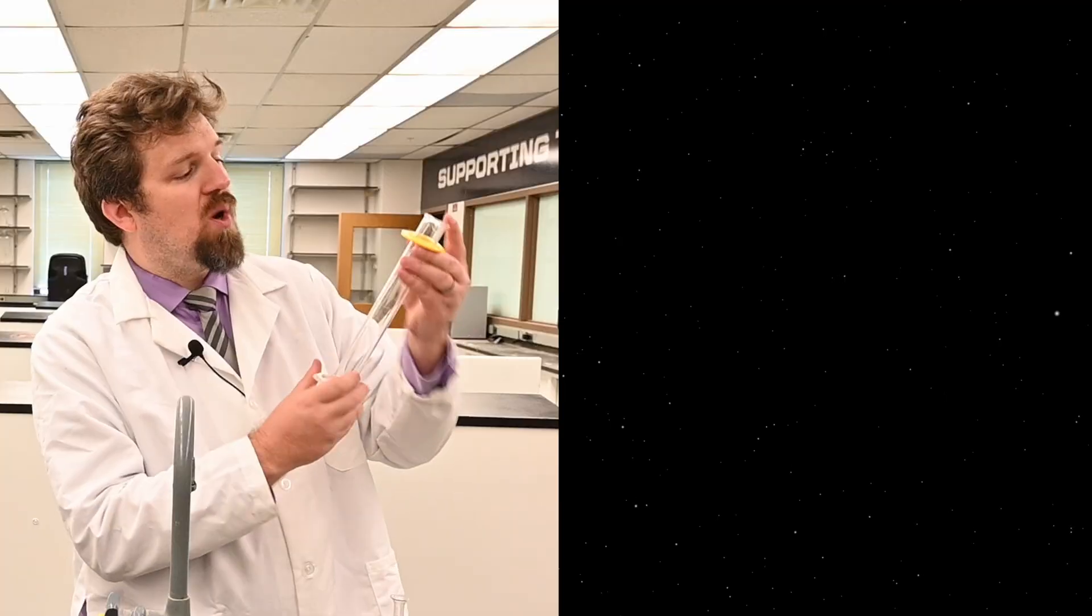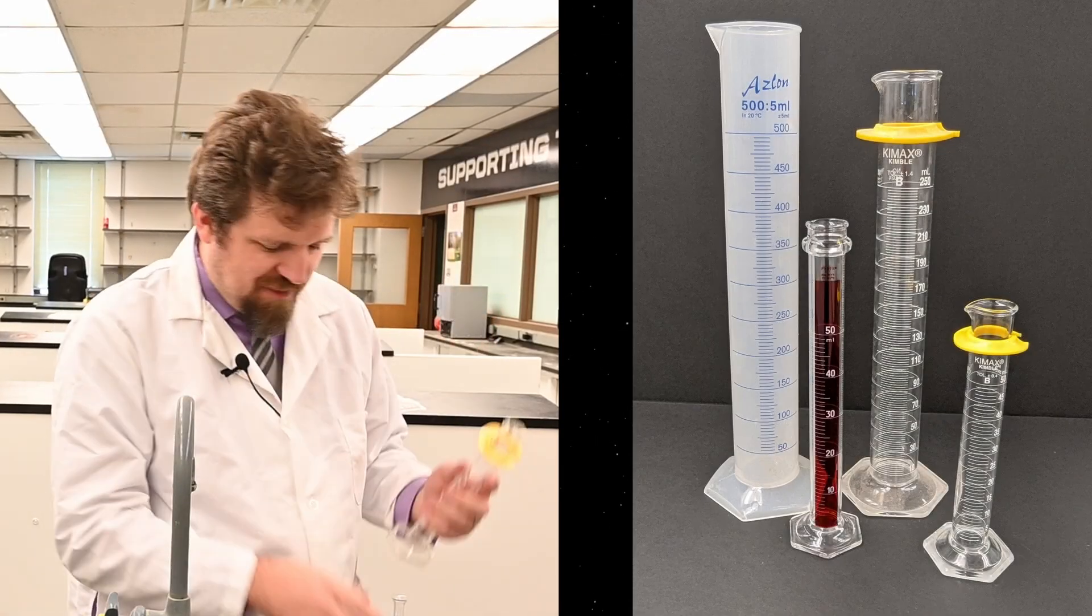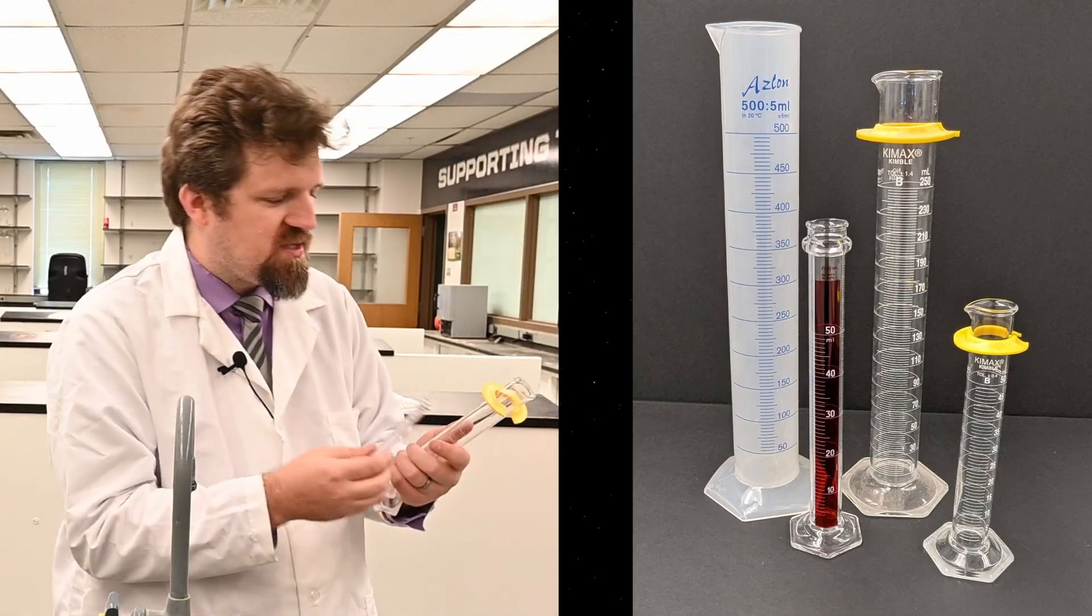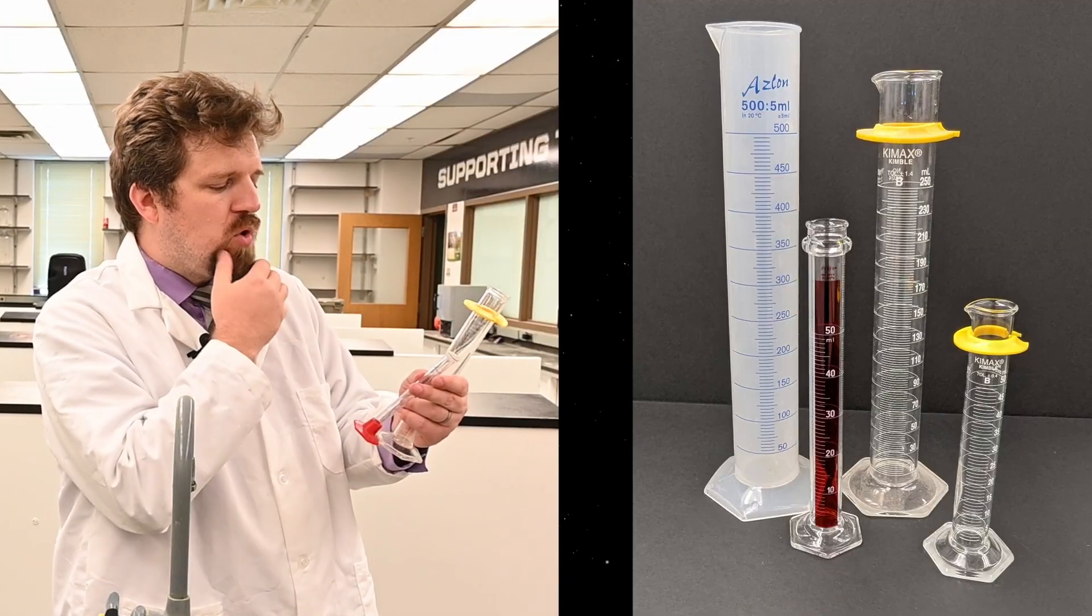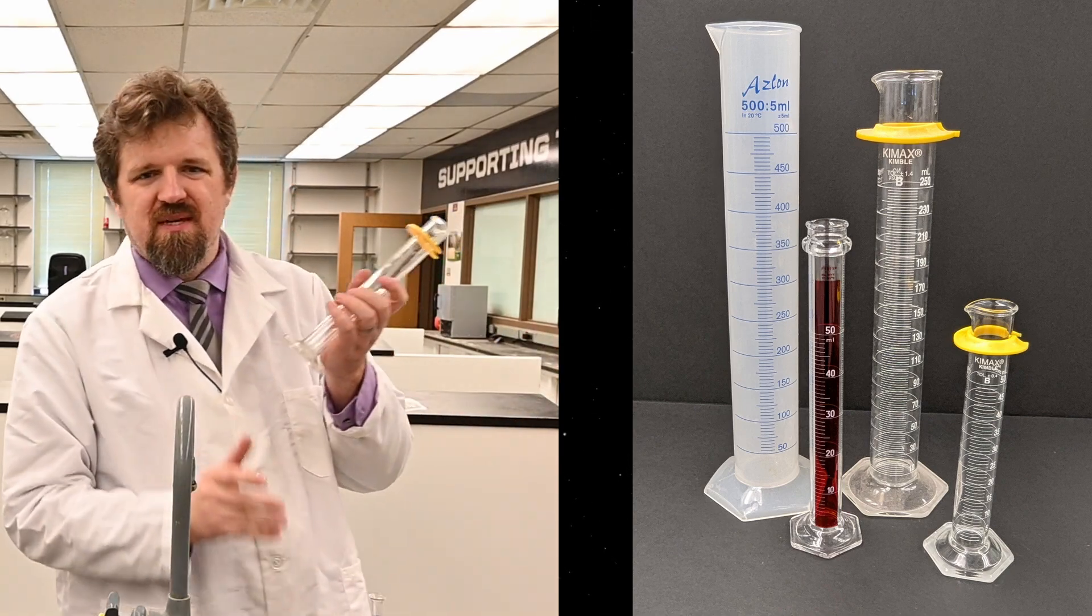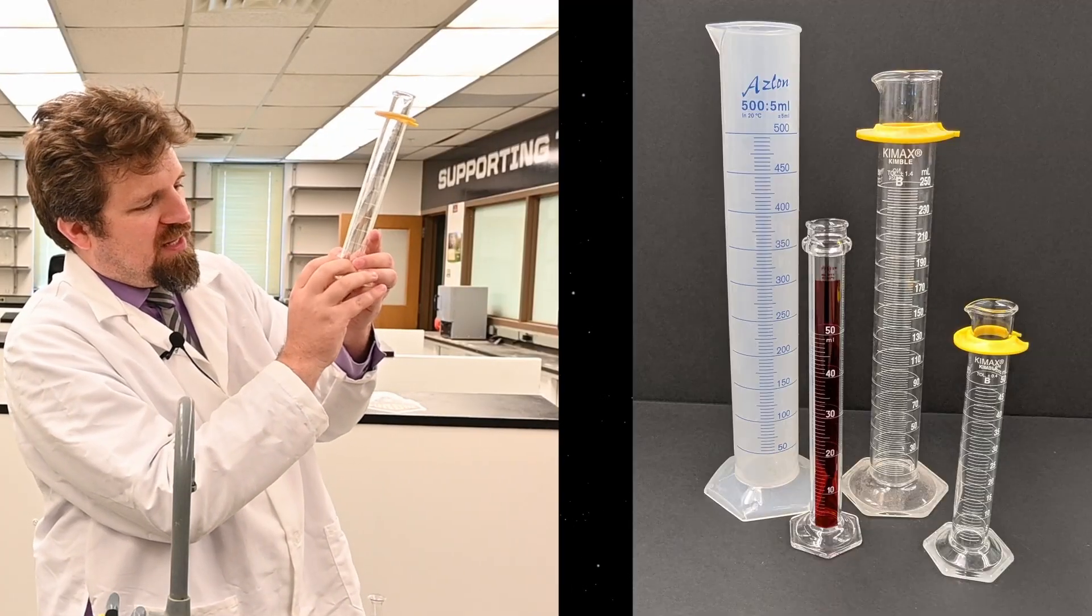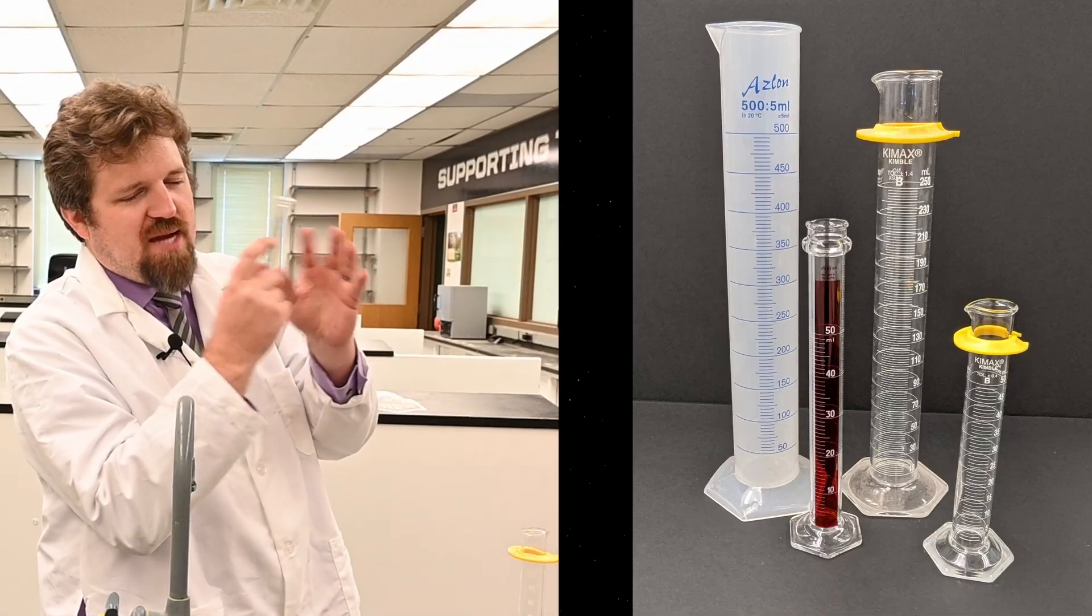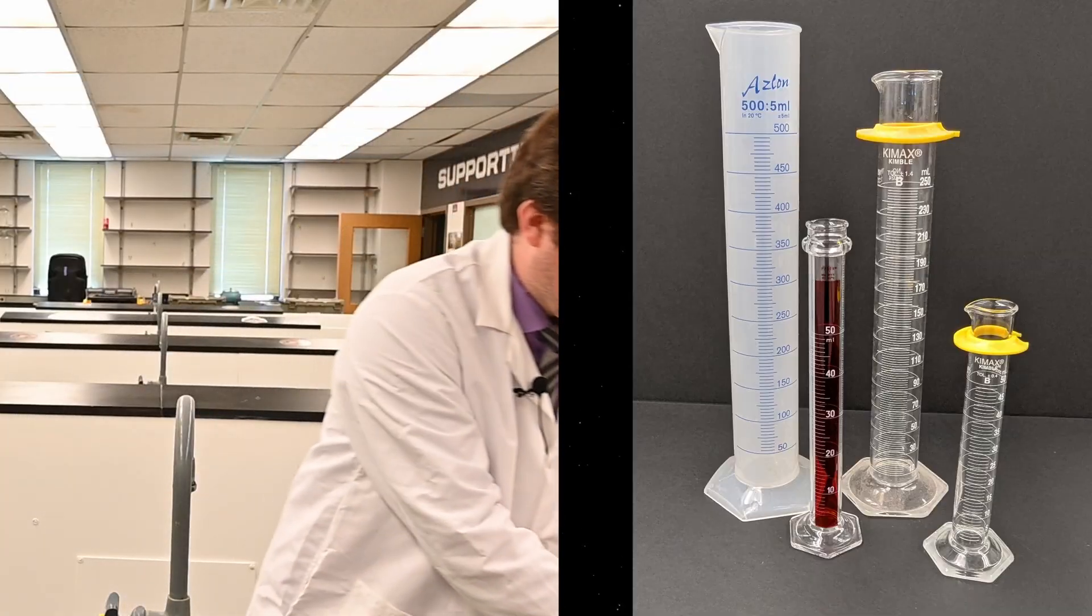This one is a 100 mil graduated cylinder. It does the same thing, they both measure the same thing, so you think, when do you use what? Well, obviously, it's the volume you're using. You want to use a piece of equipment that is close to the max of what you're measuring. So if you were measuring 9 mils, you could use this, but why, when you have this available? If you have this available, that 9 right there is going to be far more precise than a 9.